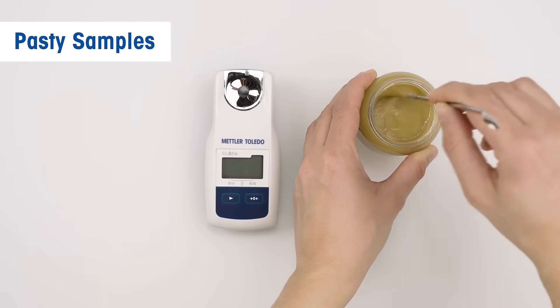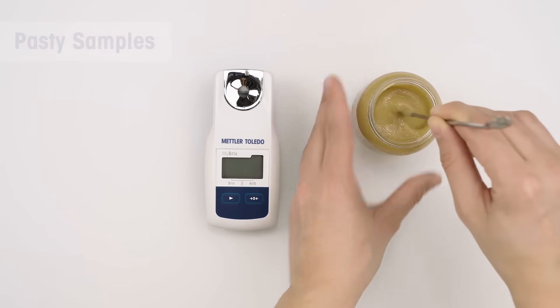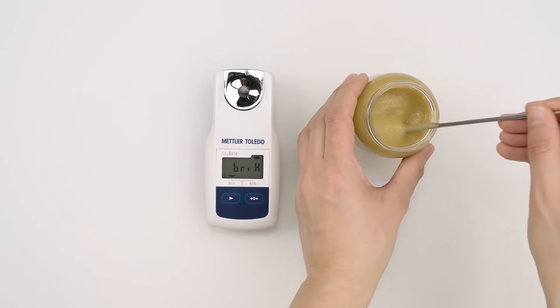For pasty samples like baby food, mix your sample before applying it on the prism to avoid air pockets.